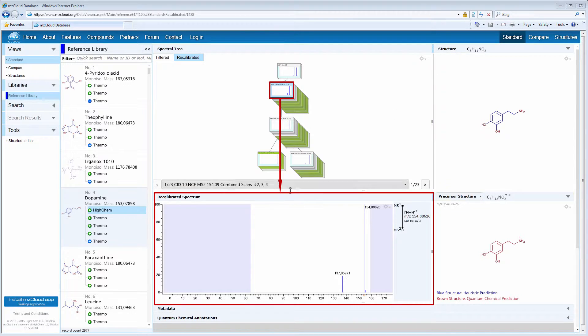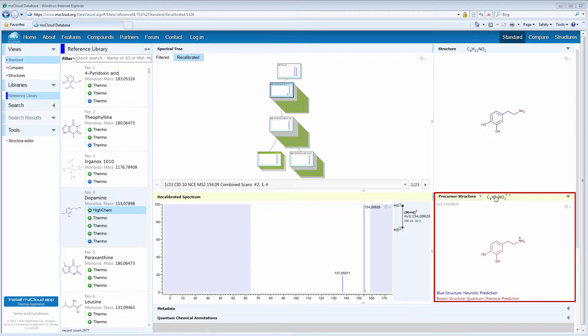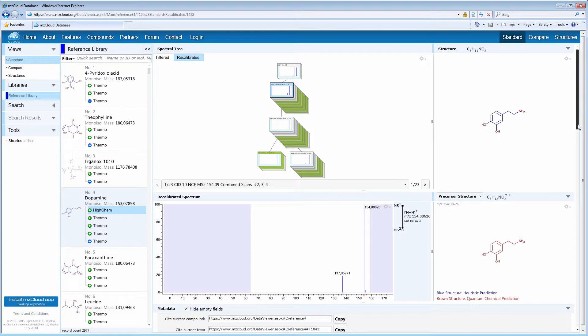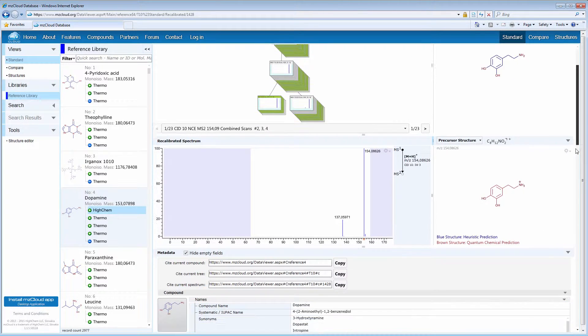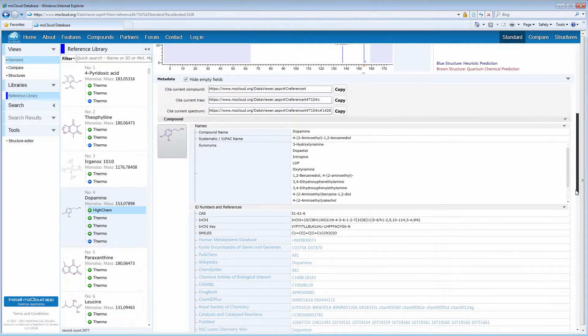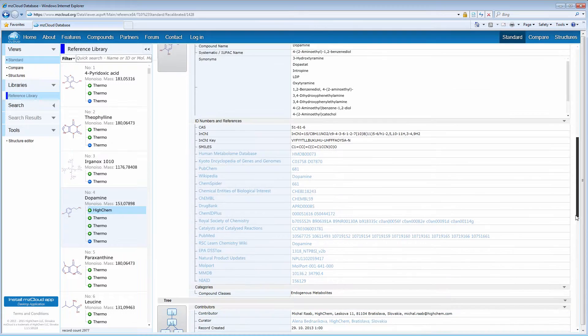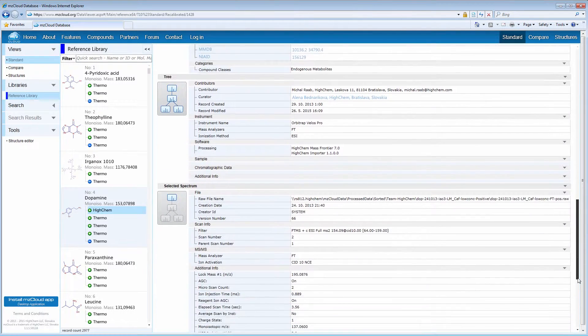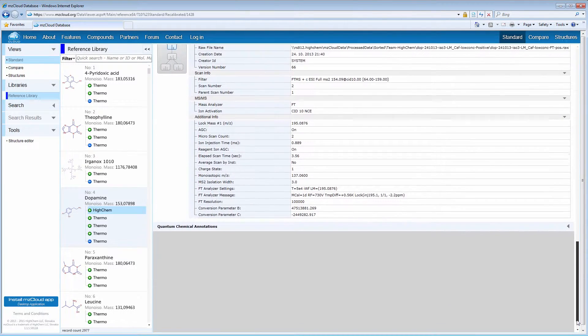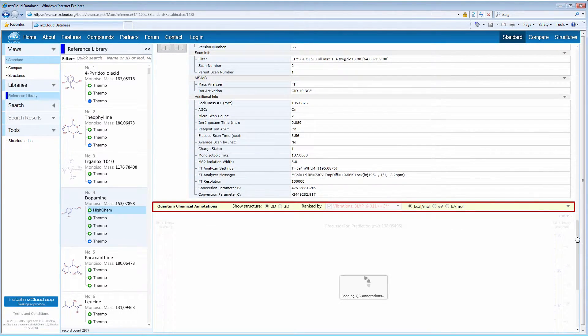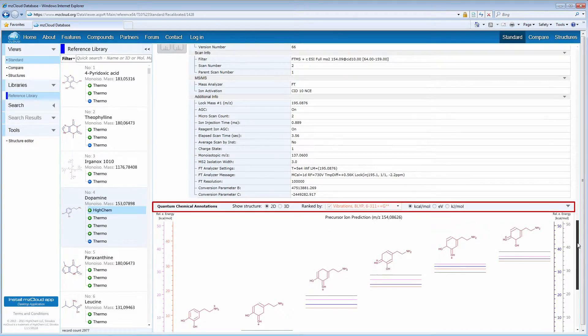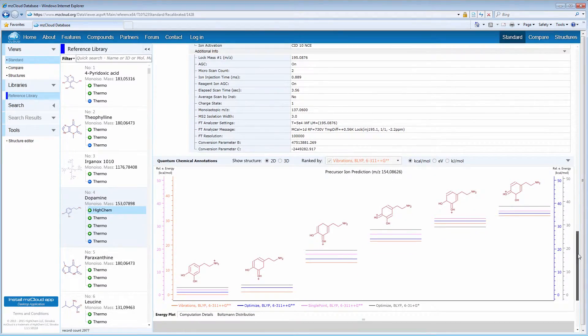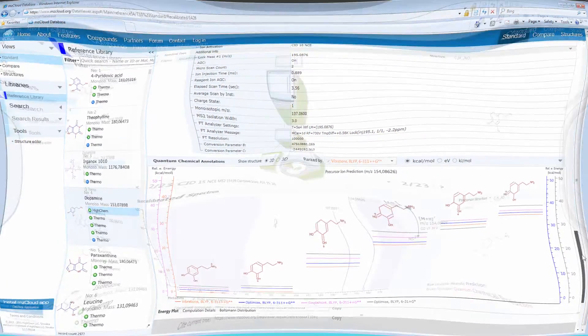The spectra of the selected node, the precursor structure, and the wealth of metadata relating to the reference compound, spectra contributor, deployed instrument, and experimental parameters of the selected spectrum. Predicted fragments are calculated using quantum chemical annotations, which is a unique feature of MZCloud.